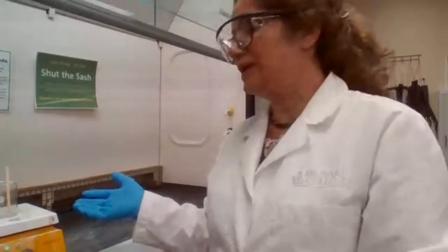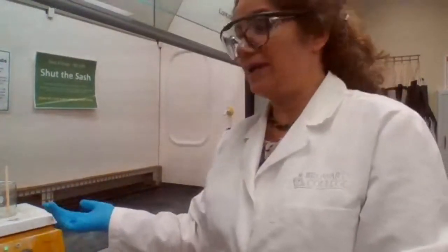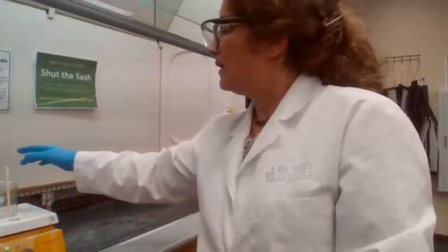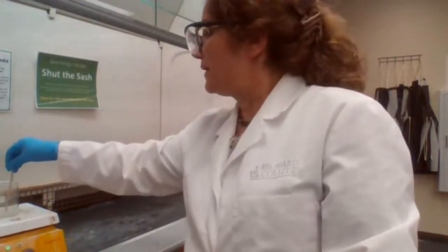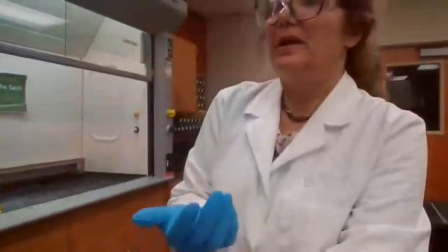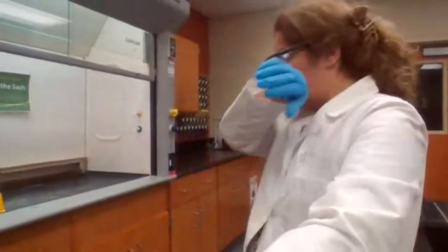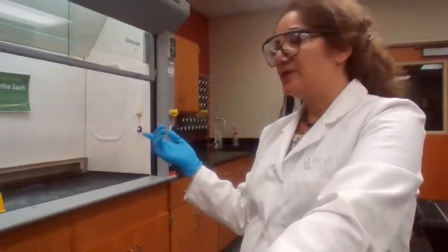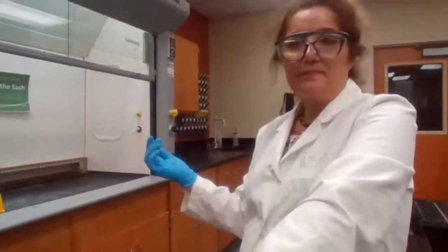For the detail in the lab report, 3 or 4 is fine. Yes, you can put it between 3 and 4. That would be the setting on the hot plate. And you monitor the boiling, and you wait until it stops boiling. And if you have the boiling point for your ether, you can also use a thermometer. Let's say the boiling point for the ether is 50, okay?